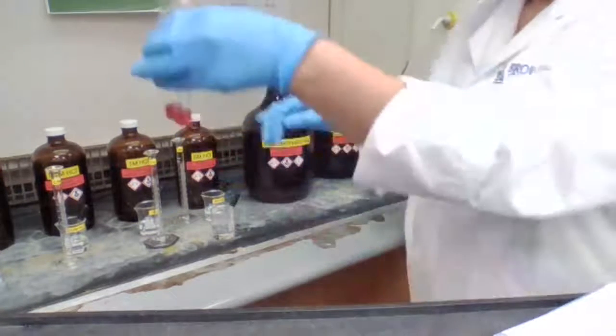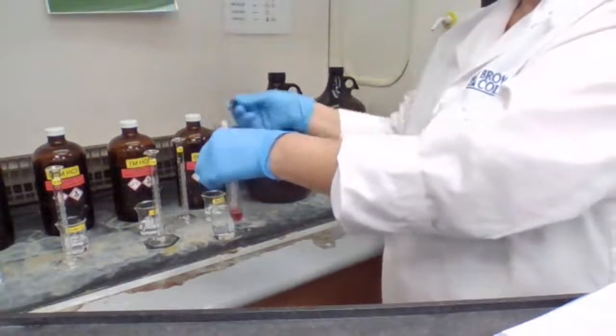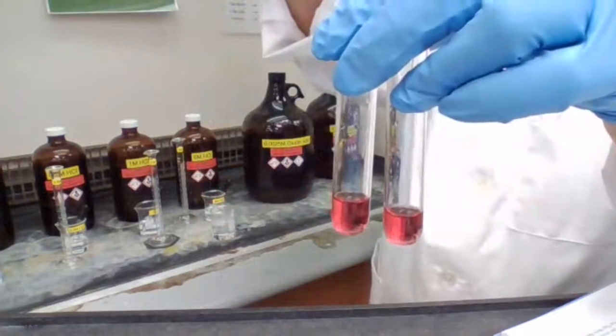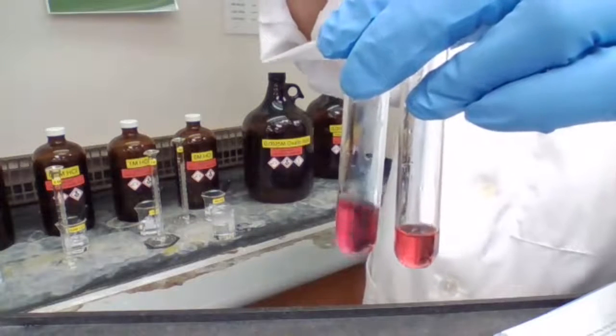Okay. So you record the color already. We are adding HCl. This HCl is not just adding H+, it's also adding chloride ion.